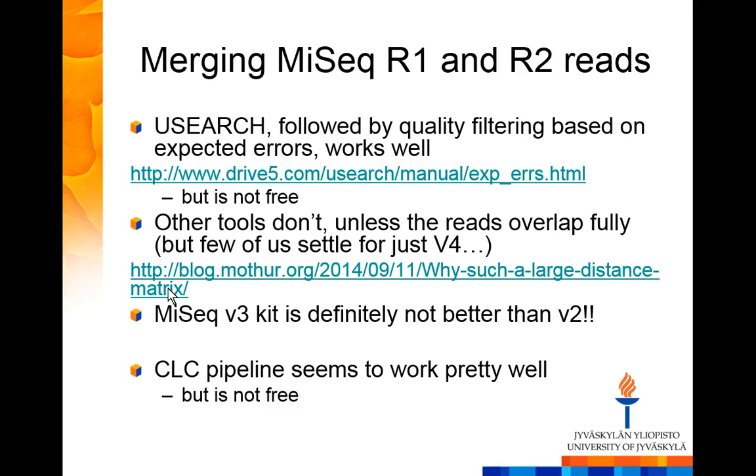He fully admits that the merge tool in mothur doesn't work very well if you don't have full overlap.